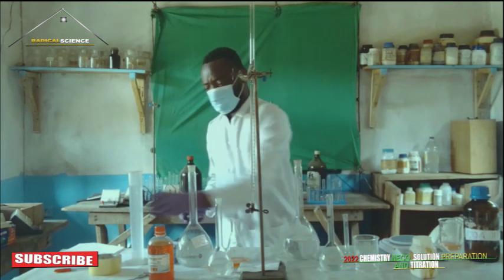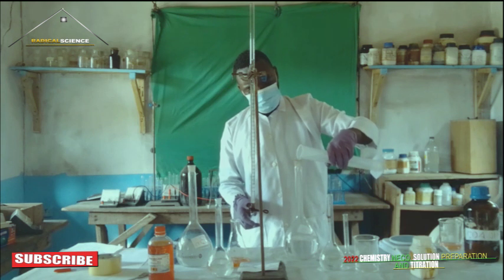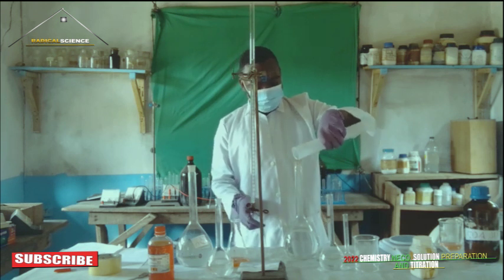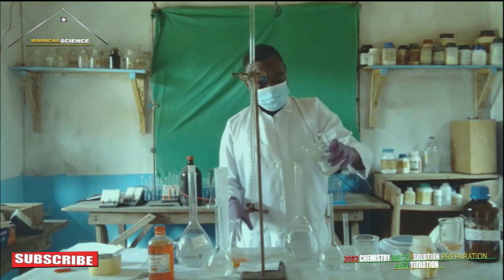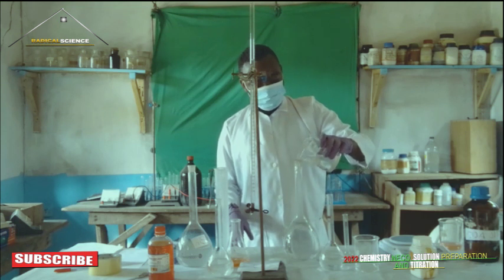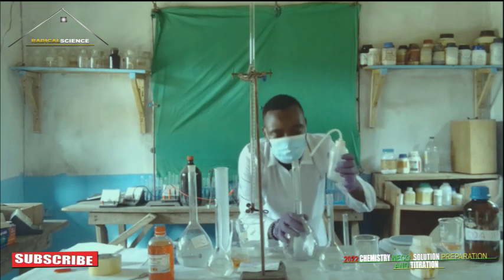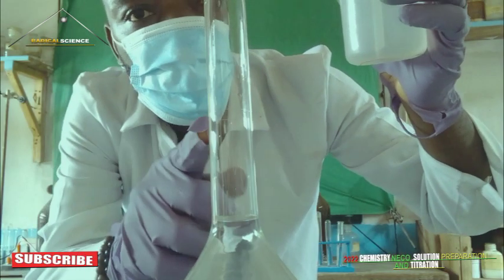Now you fill it with water, and you must make sure that it doesn't exceed the line.